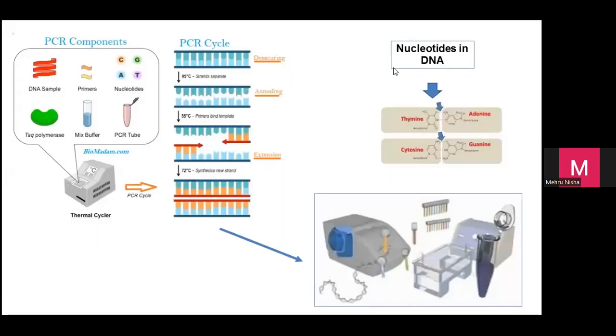Okay, ini merupakan ingredients, bahan-bahan yang kita perlukan untuk buat PCR. First and foremost, DNA template anda, primer, ATCG. ATCG ni apa dia? Cytosine, guanine, adenine, thymine. DNA. Tapi kalau di RNA, T tak ada, diganti dengan U, uracil di RNA. Tapi DNA, we have this.